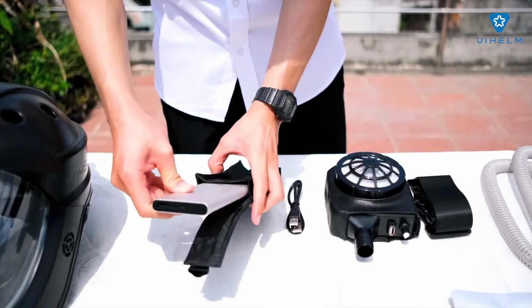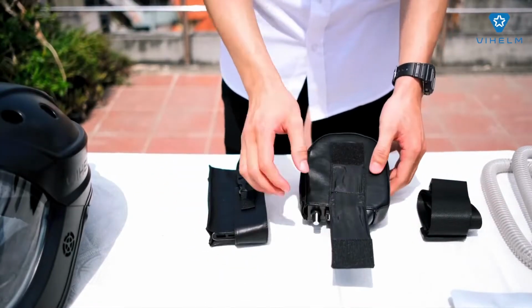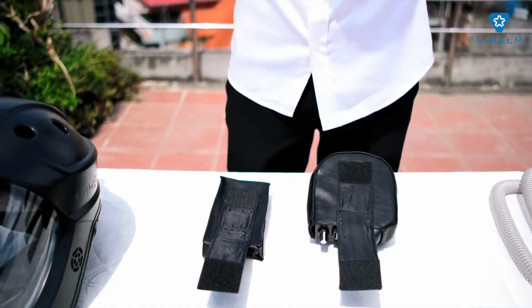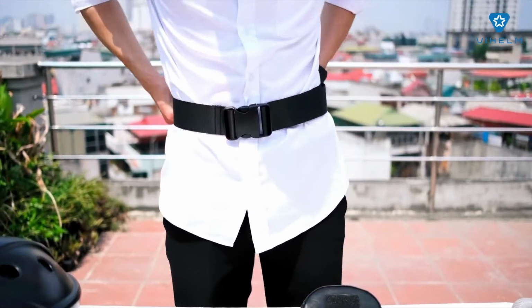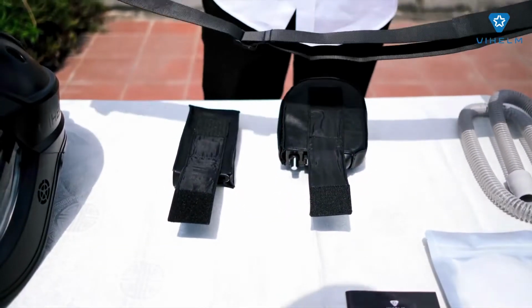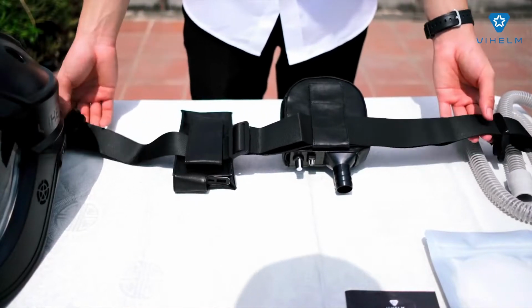Step 1. Put the fully charged battery in the battery pouch. Open the velcro tapes on the back of the battery pouch and the blower pouch. Try on and adjust the belt size to fit your waist. Then place the belt on top of the battery pouch and blower pouch where the velcro tapes are located. Reattach the velcro tapes to keep the two pouches in place on the belt.